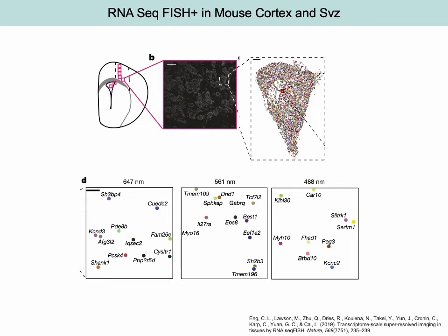You can see these really dense dots of these 10,000 different transcripts. And then when you zoom in further, you can see the location of each transcript with about 100 nanometers resolution.